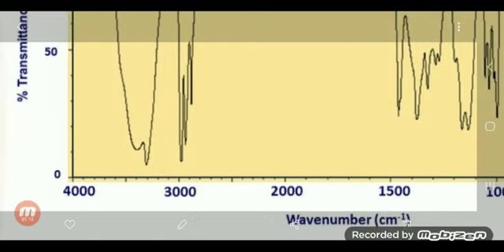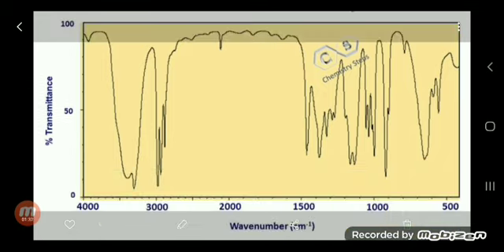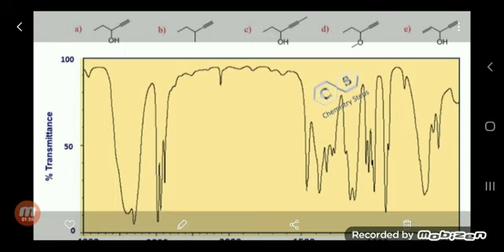power negative 1, actually. And the theory of FTIR depends on the dipole moment in the molecule. Like here, A, B, C, D, we see OH, C, we have positive and negative charges, and the FTIR depends on this in detecting the molecules we measure. For example, oil here.